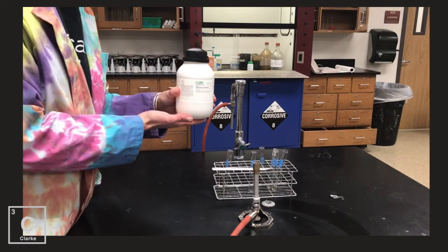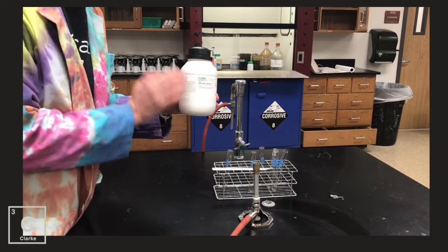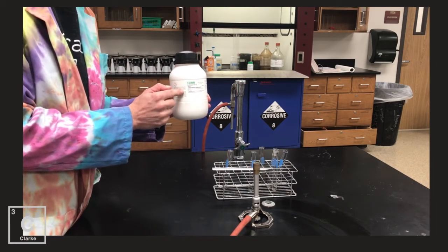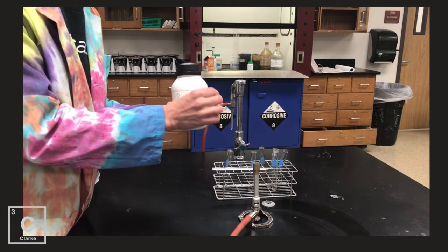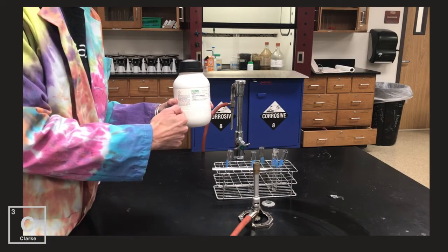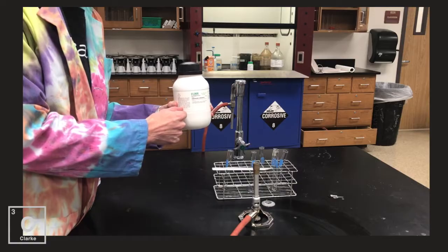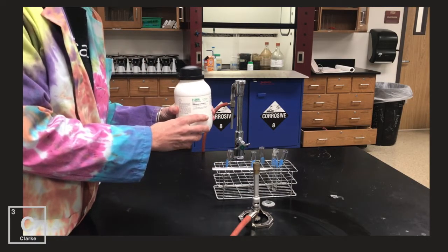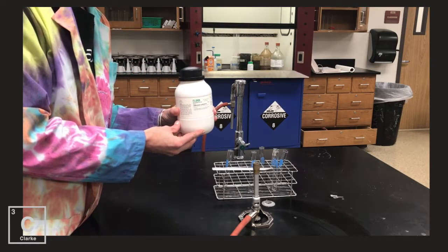In this lab station, we're going to break down ammonium carbonate. Now, when you have a solid, to break it down we will first need to heat it up. So I'm first going to put some of this solid into a test tube and heat it up to start breaking it down. We need to figure out what this ammonium carbonate is breaking down into, because it's not going to just break down into its simple elements like we've been learning in class. So we're going to do a few tests.